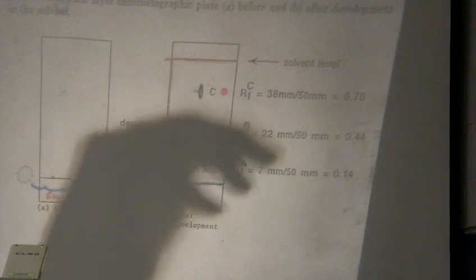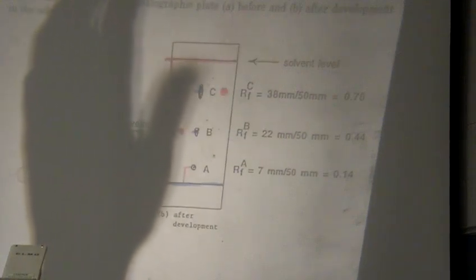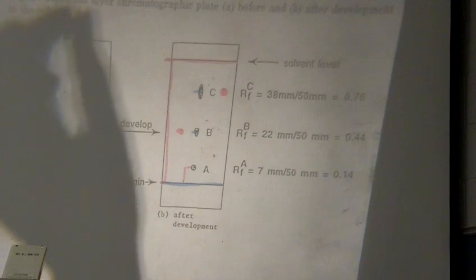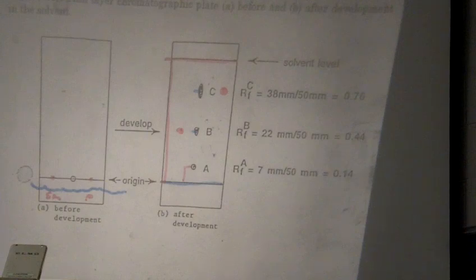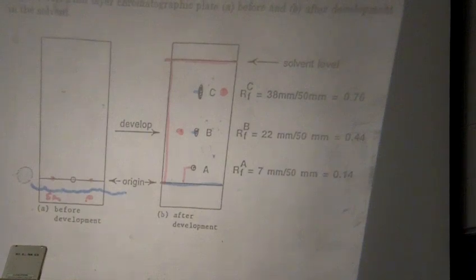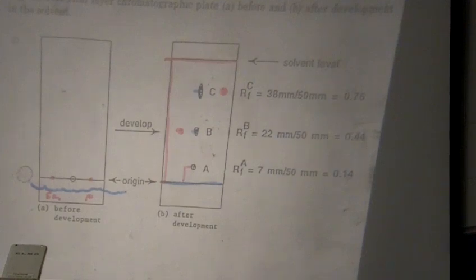Now we talked about relative polarity with the TLC plates. One thing that's key with TLC plates is you're not going to make an eluent so polar that it becomes more polar than the silica. There's not really a usable eluent that is going to become more polar than the silica, because usually what will happen is it'll actually dissolve your silica. So your spot is never going to outrun your solvent or stay right with your solvent. It's always going to be at least a little bit less polar.